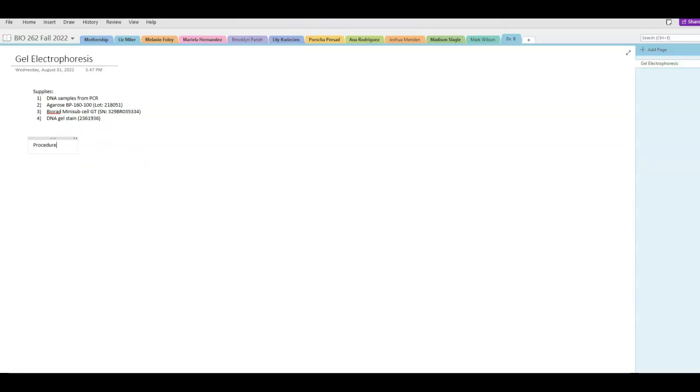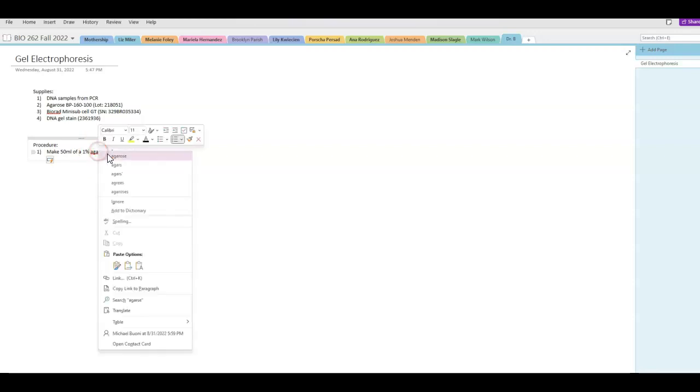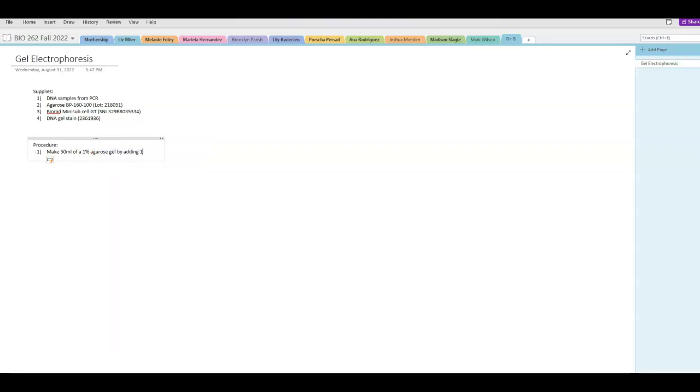and this is from what I had on the board for whatever class or what you'd written in your notebook. First thing would be make a 1% agarose gel. Actually, if I change it, make 50 milliliters of a 1% agarose gel by adding 0.5 grams of agarose to 50 milliliters of 1x SB buffer. That's enough. It's obviously understood that I microwave and whatnot, but after that I also want to make sure I add 5 microliters of, I can just say now, DNA gel stain, because it knows what it is above. And so that's what I did.